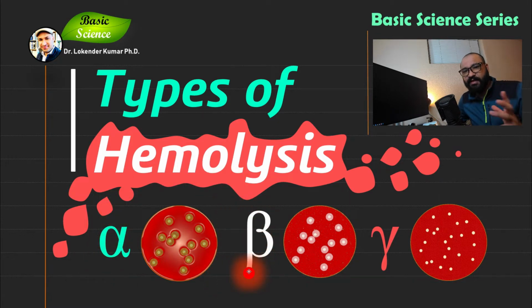And second type is the beta hemolysis. Beta hemolysis is also known as complete hemolysis. Alpha hemolysis is known as partial hemolysis. I will explain in my later slide why they are termed as the partial as well as the complete hemolysis, right? Not the weak. In case of beta hemolysis, you will have complete hemolysis. That is why you will have clear zone of hemolysis. It will not be the greenish or brownish tinge in the hemolysis, right? That is why I'm trying to show you here. As you can see, the zones are clear.